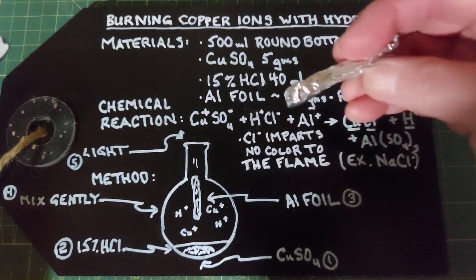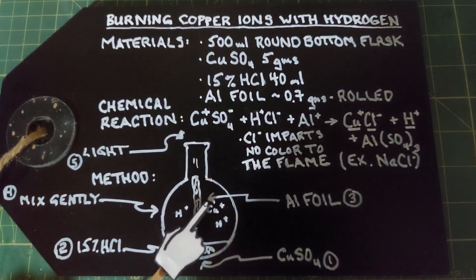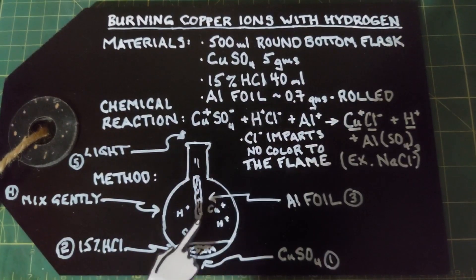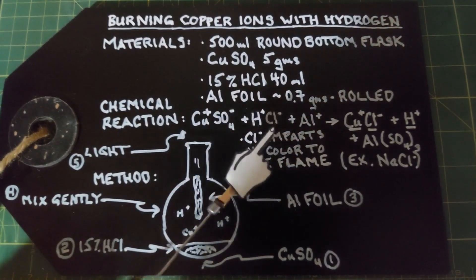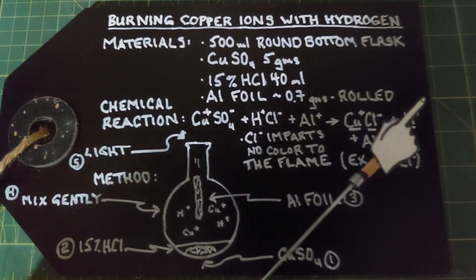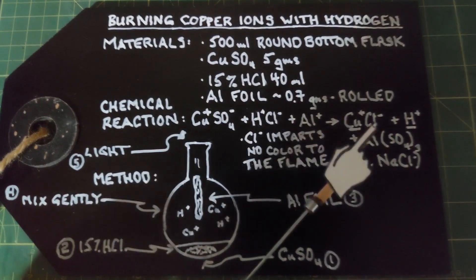The aluminum foil is rolled so you can stick it in the top of the round bottom flask. The chemical reaction goes as follows: we have copper sulfate, hydrochloric acid, and aluminum all in the flask. Each one of these has positive or negative charges in their ions. When you add these together you'll end up with copper chloride, hydrogen gas, and aluminum sulfate — this is not a balanced equation but just an overview.